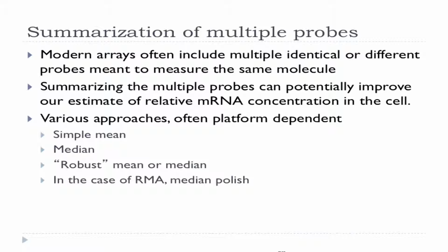And in the case of RMA, which you guys will be using for both Naomi's lab and my lab, use something called median polish. I'm not going to go through it, but it's a robust and iterative approach to summarizing probes on an array.